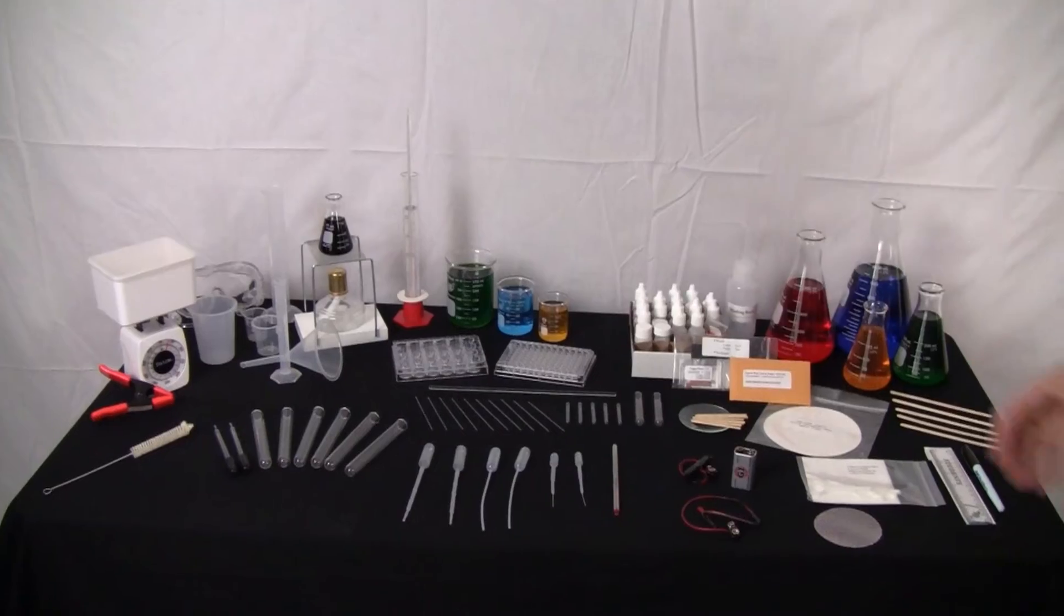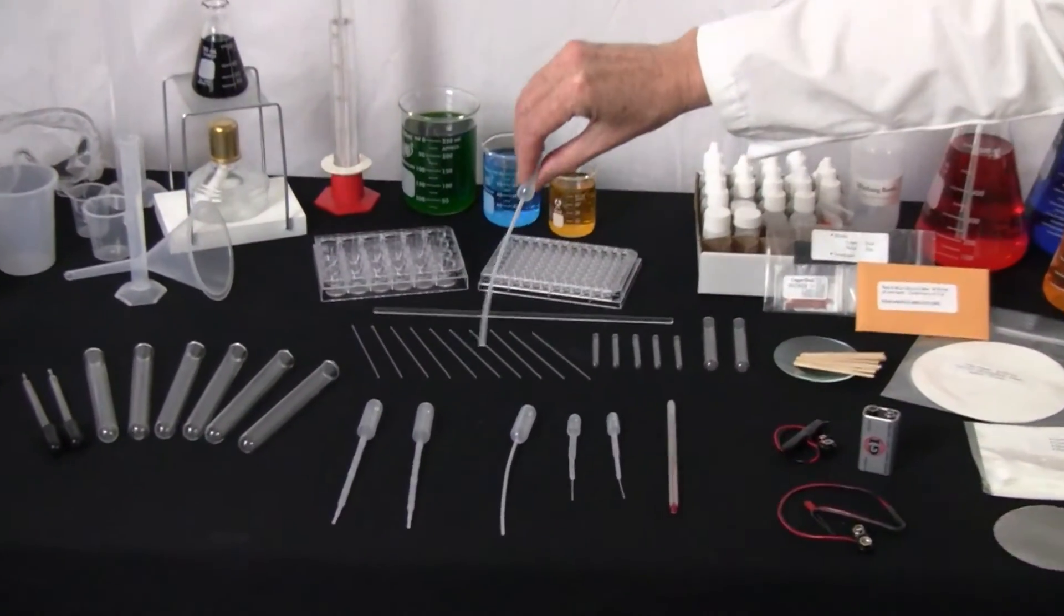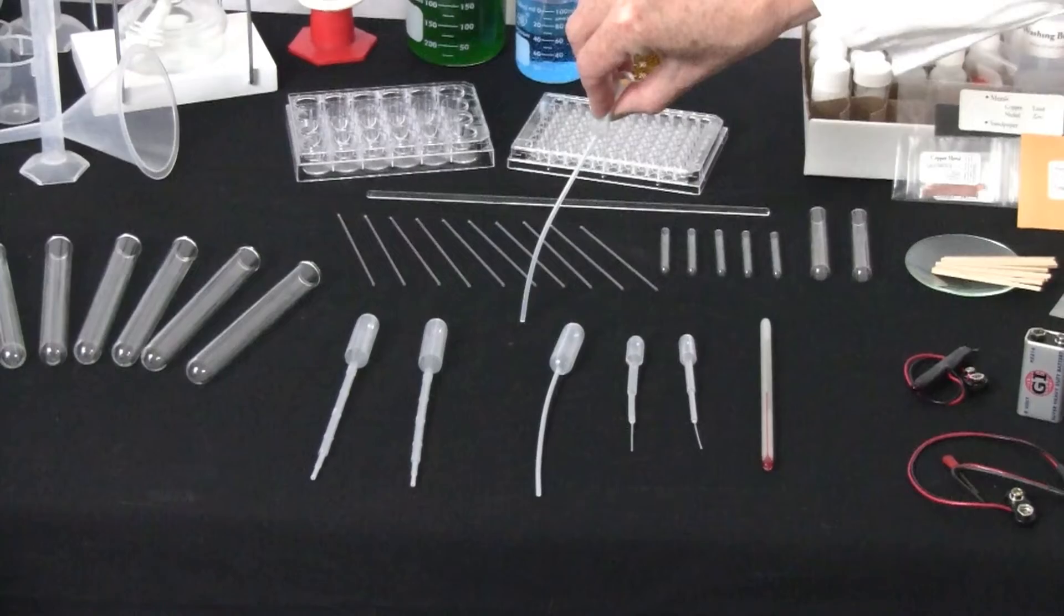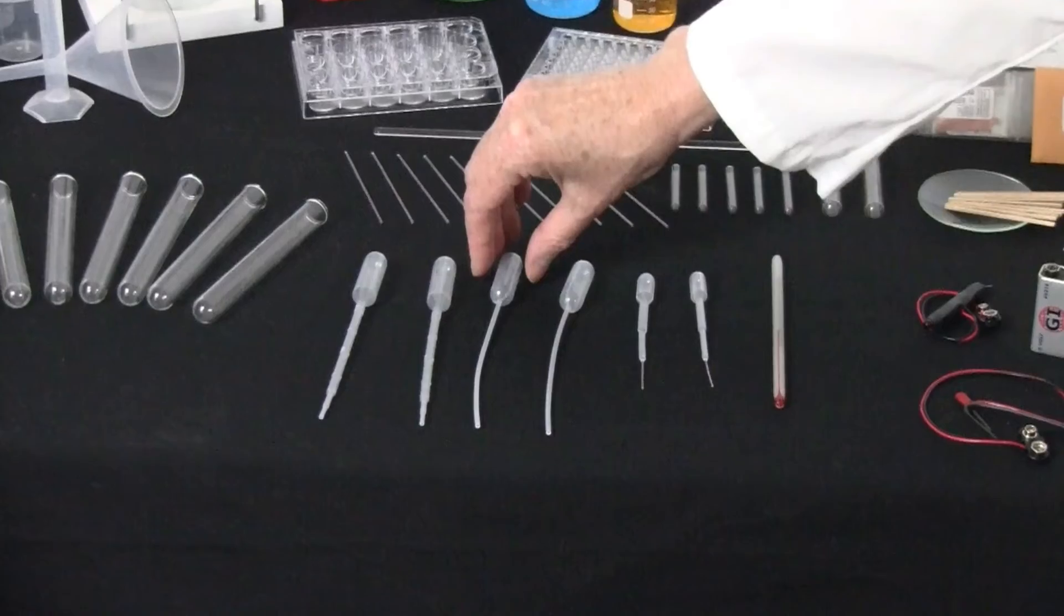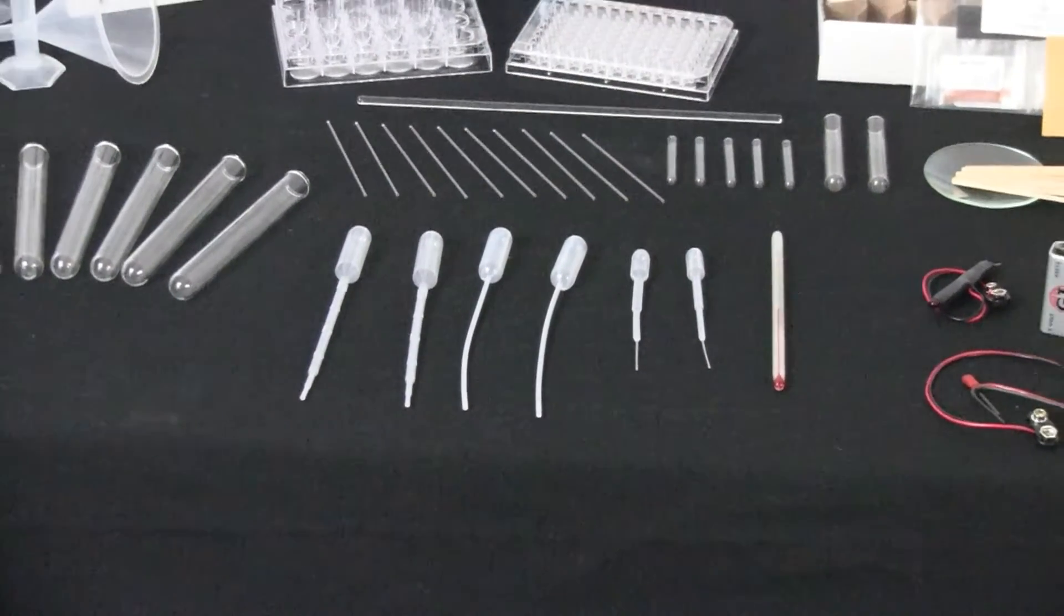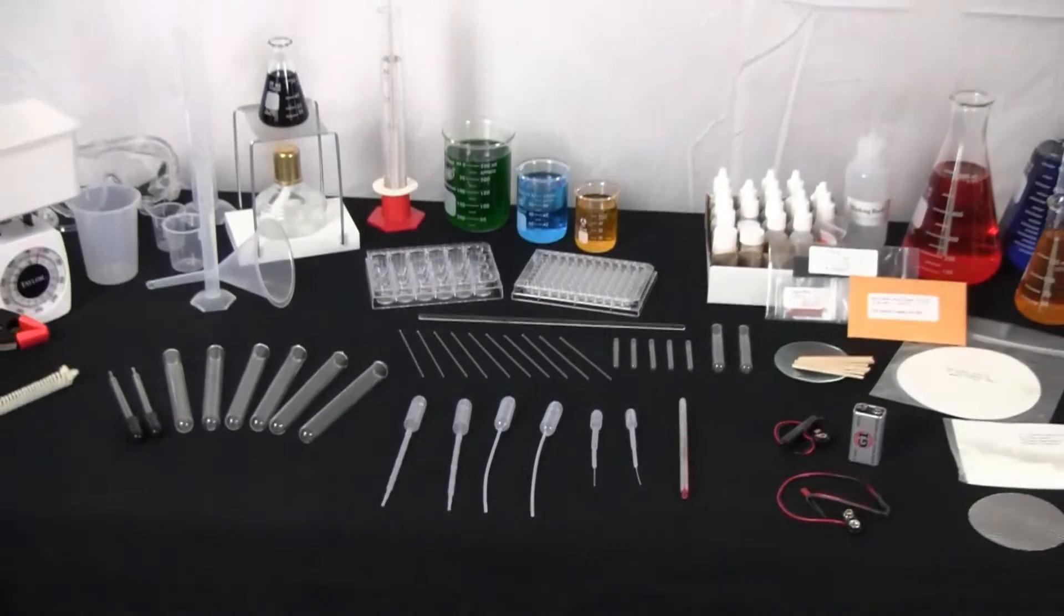Now we have pipettes. These little pipettes are used for getting a drop of something and putting a drop some place else, so small amounts of liquids can be grabbed through those pipettes.